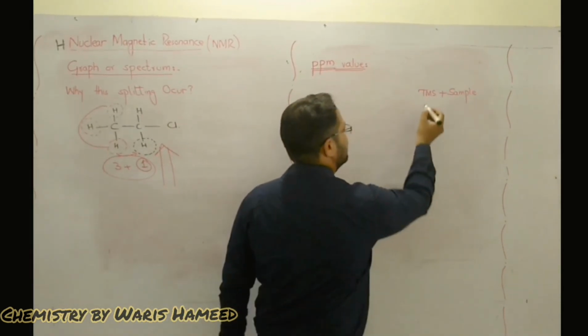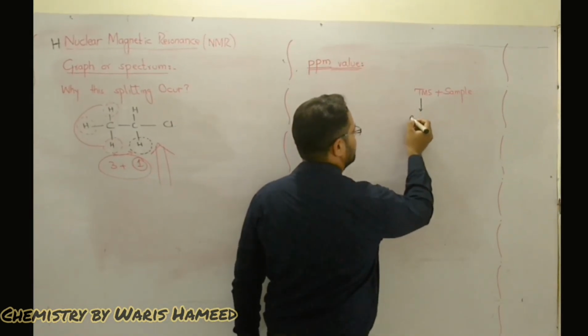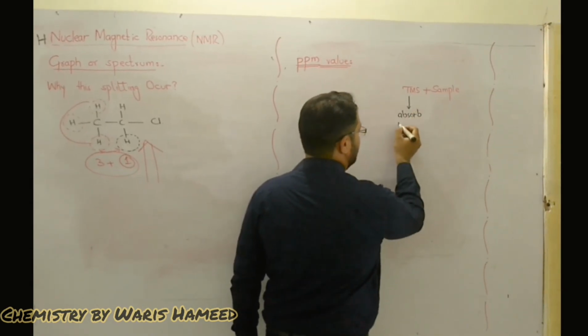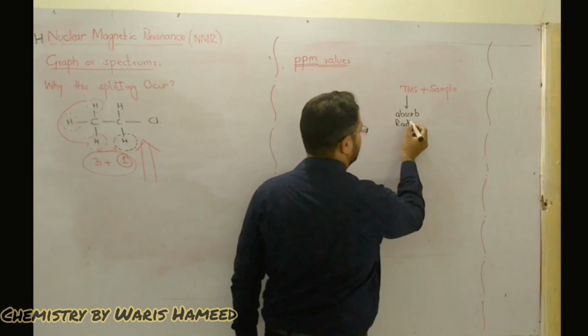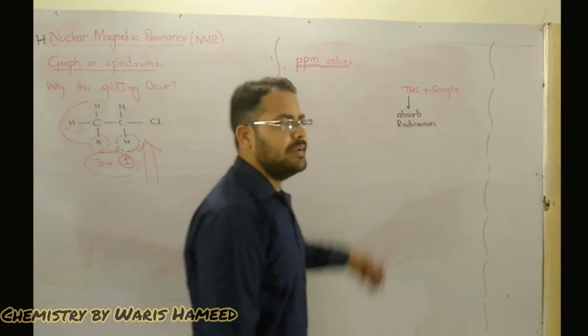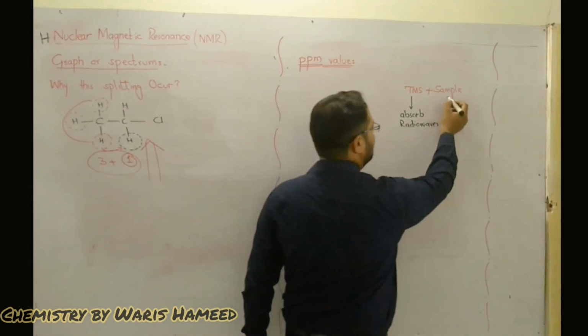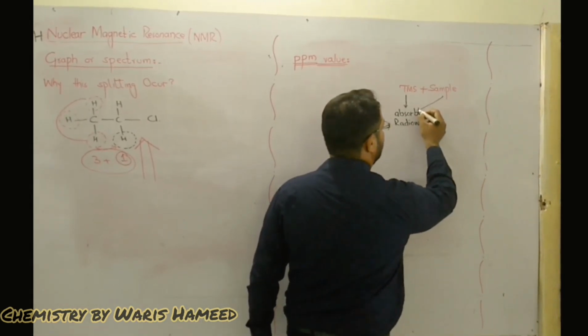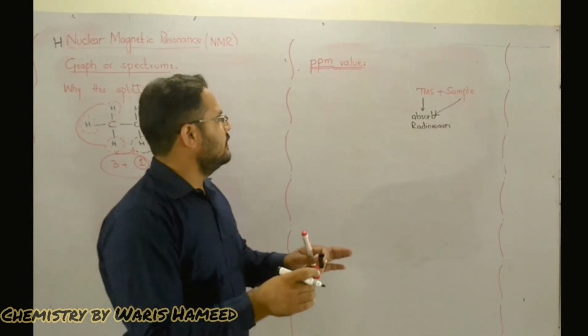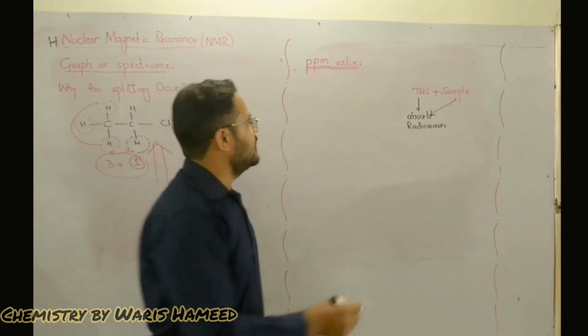So this TMS will absorb radio waves, and the sample will also absorb radio waves. Both these two components absorb radio waves.